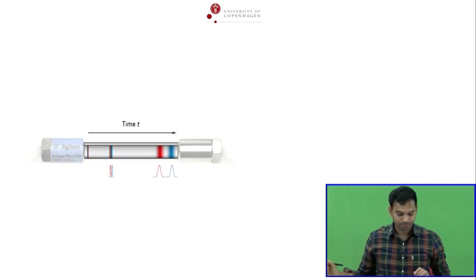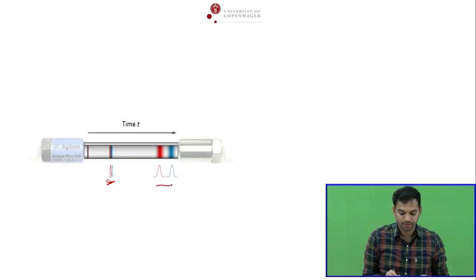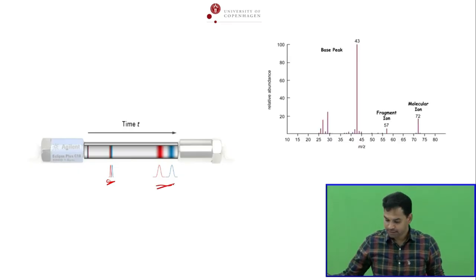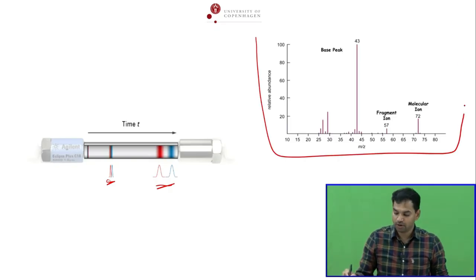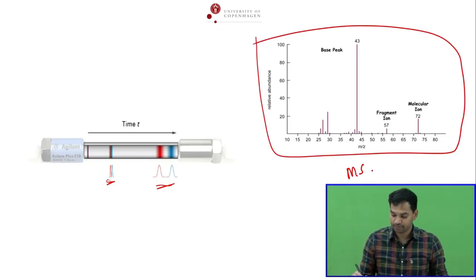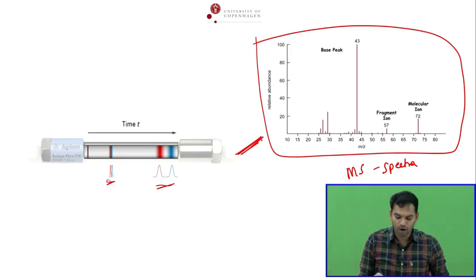Now, we have been seeing that in the HPLC, separation takes place based on the band, and then that reaches the MS, and then you will get something called MS spectra. Okay, and that is the end product, the MS spectra. In between, a lot of things happen, right?